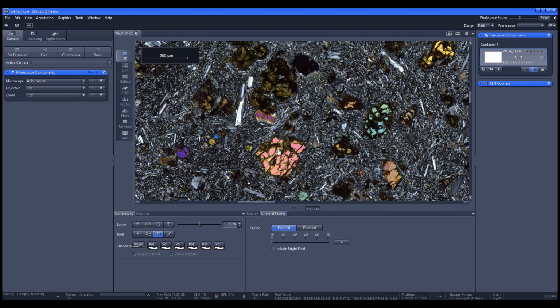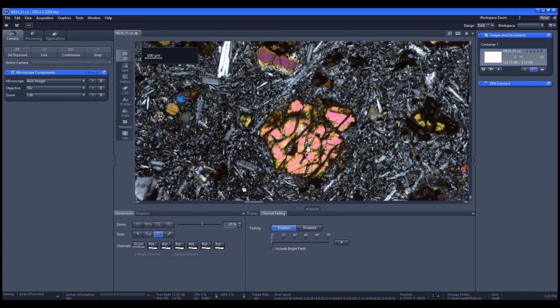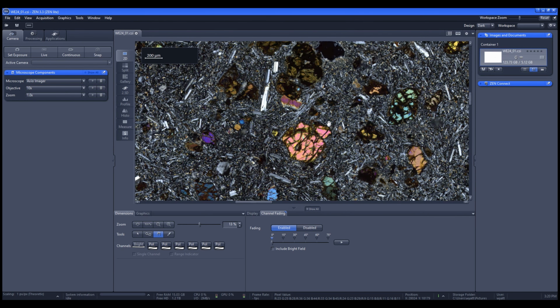Something else to know, if you're not familiar with minerals, there's this thing called cleavage. Some minerals have it, some minerals don't. If a mineral doesn't have cleavage, it will have fracture. So this is basically how the mineral breaks apart. Some minerals have 1 cleavage, some have 2, 3, 4, and so on. Olivine has no cleavage, which means it has fracture. So if you were to smash this with a hammer, it would just break in random fracture patterns. There's no consistency with it, right? Now, minerals that have cleavage will be consistent in their breaking pattern. If I was to break it with a hammer, it's going to cleave in repeating parallel planes. It's going to be repeating breaking lines.